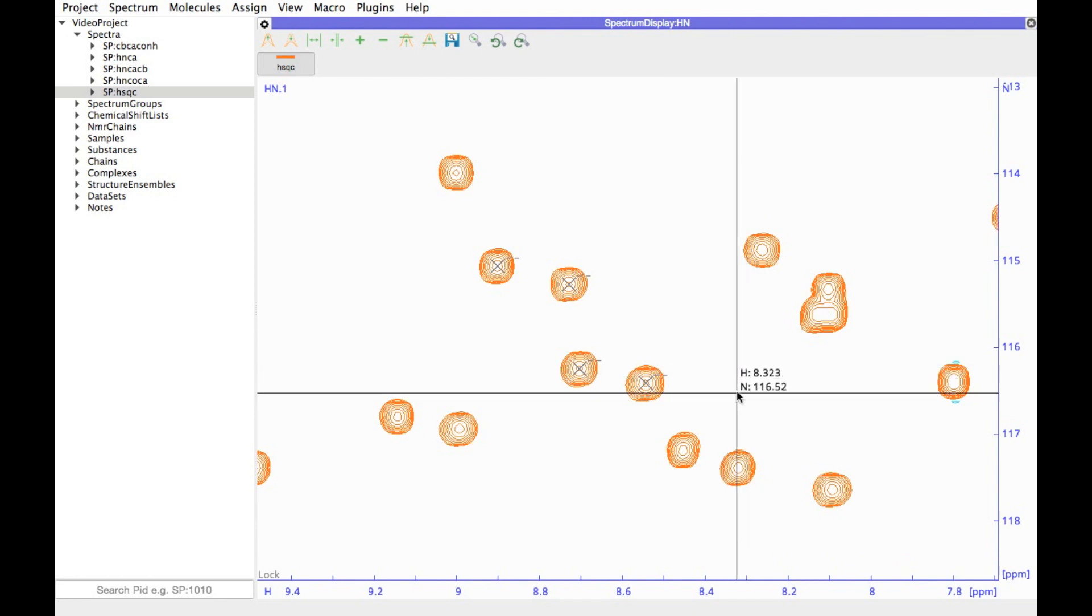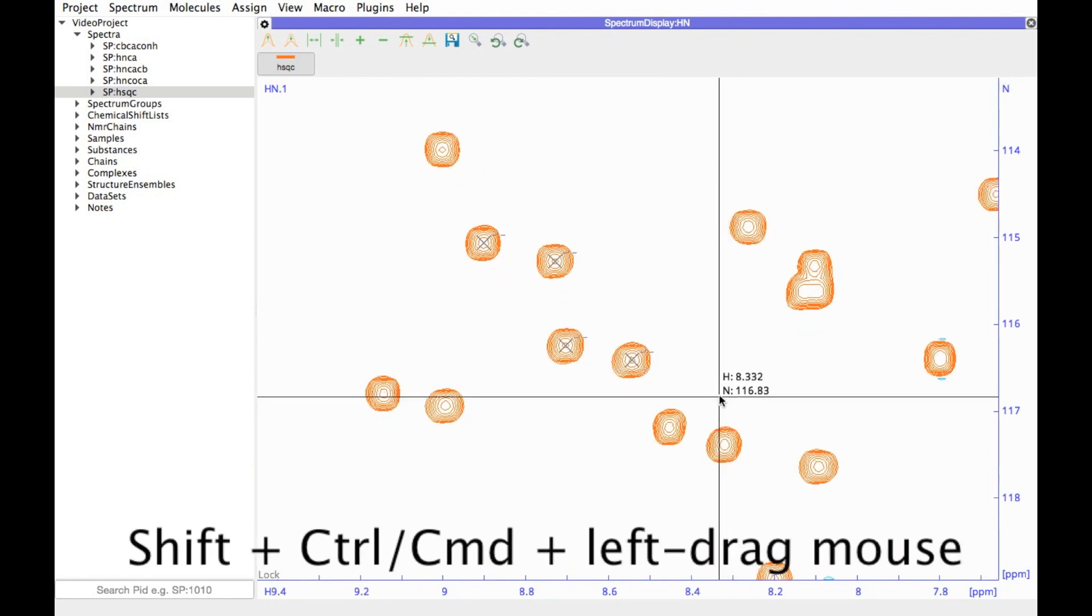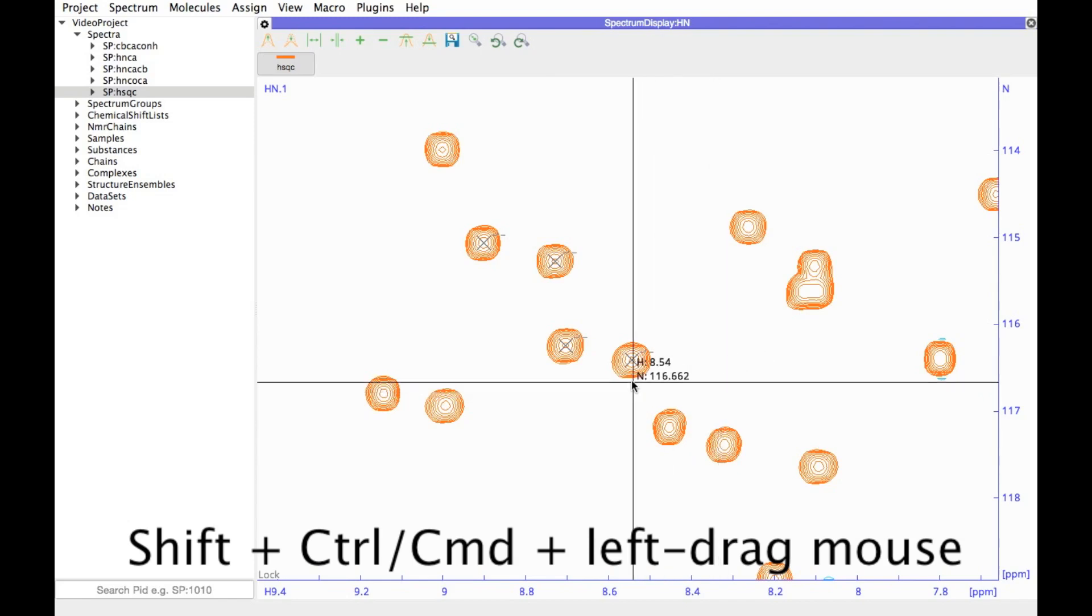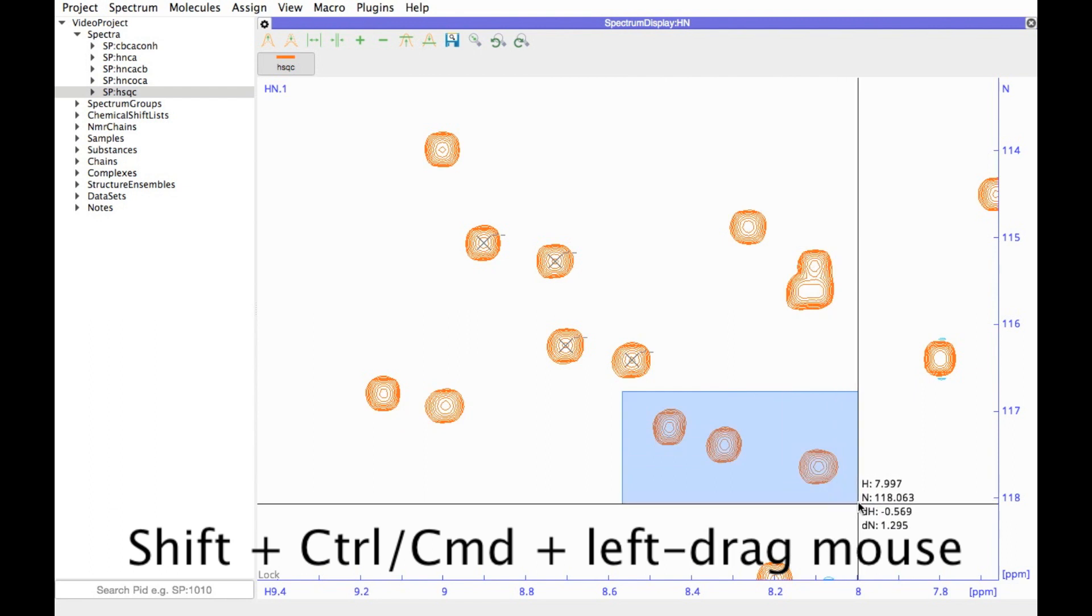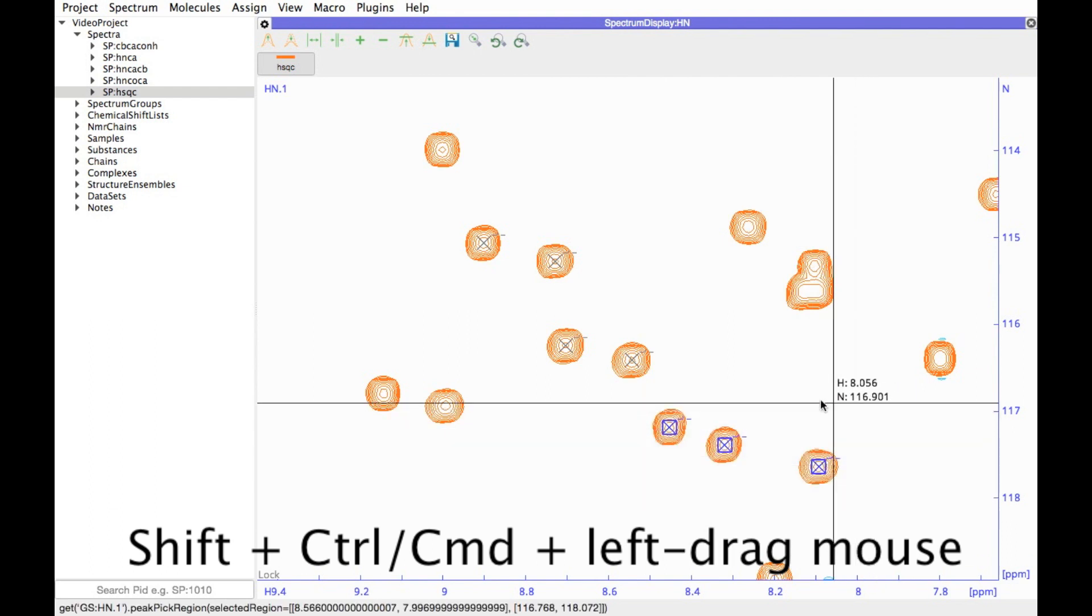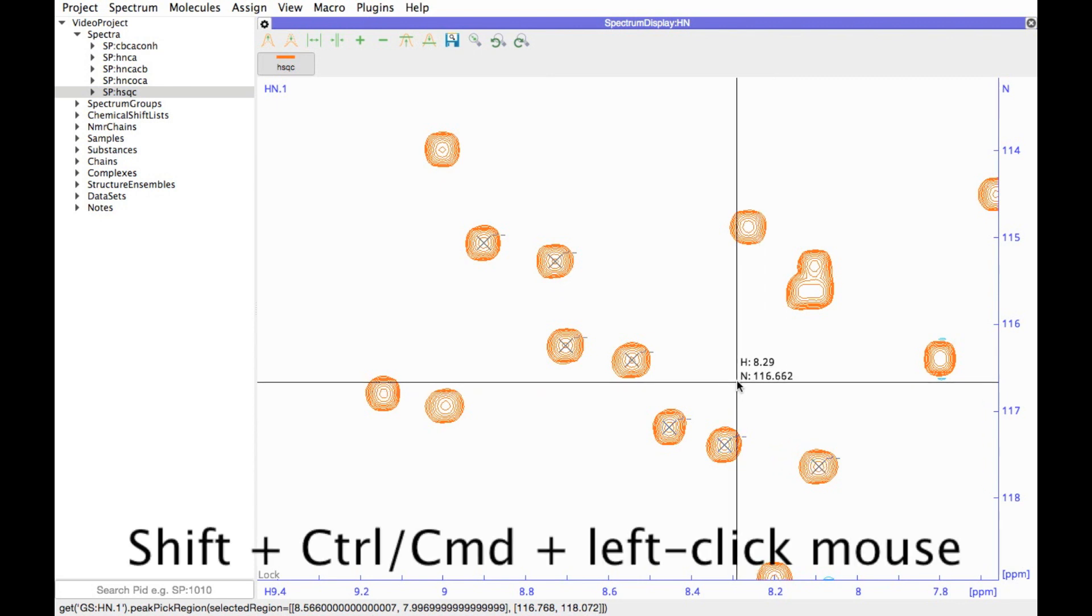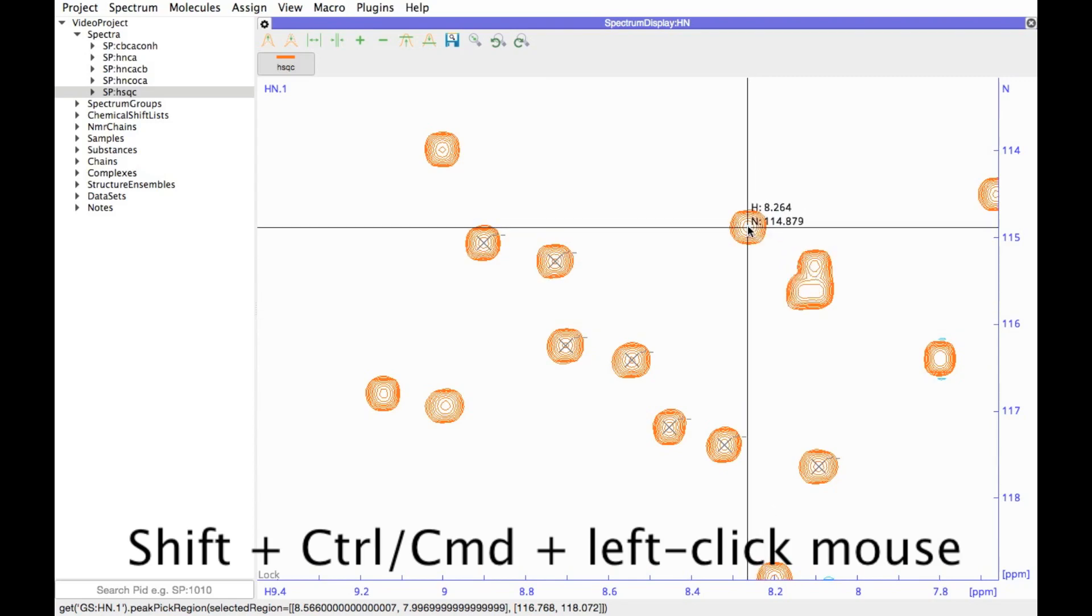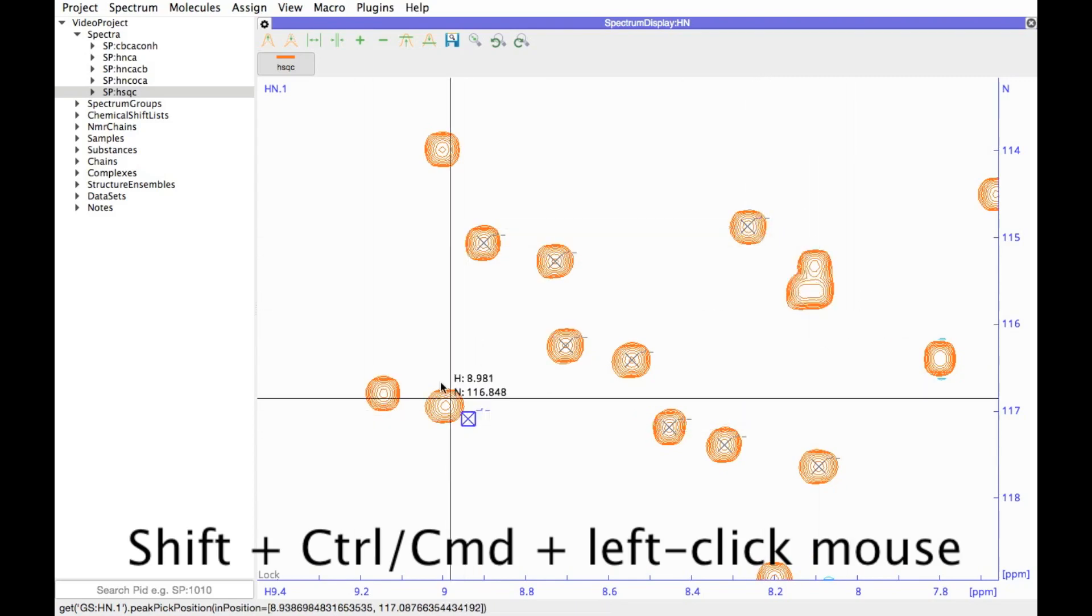In order to pick peaks, you can hold down the shift key and the control, or on a Mac the command key, drag a box. This time it will be blue and you will pick peaks. If you want to pick peaks manually, you can hold down again the shift and the control or command button, and then place your peaks where you would like to put them.